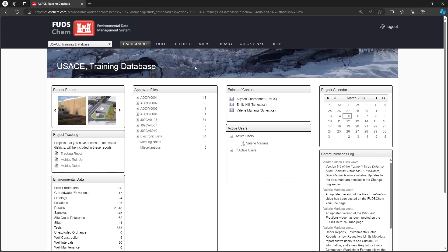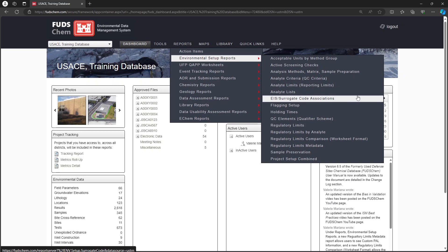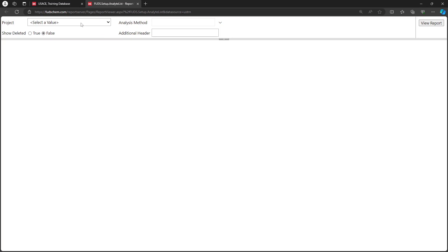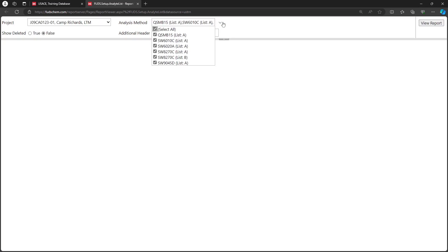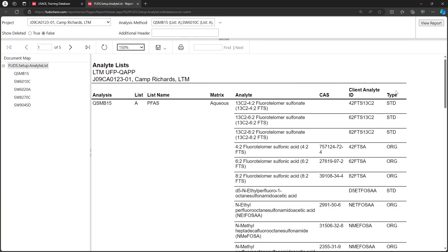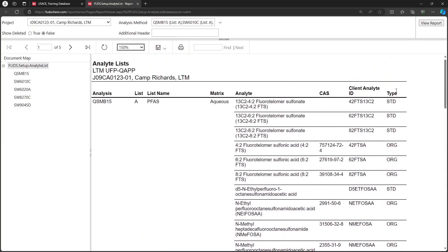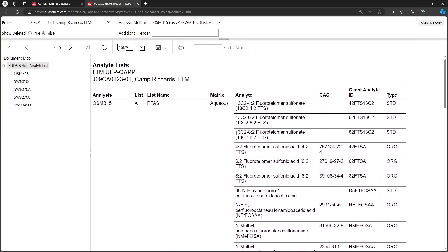Go to Reports, Environmental Setup Reports. Choose Analyte Lists, choose the project, adjust the Analysis Method drop-down if desired, then click View Report. This report shows the analyte lists for each method as established in the QAPP. The laboratory's SEDD file will need to match this list exactly — if the SEDD contains extra analytes or is missing analytes from this list, an error will be flagged. This is also true for surrogates, which are identified by the letters STD (Standard) in the Type column.